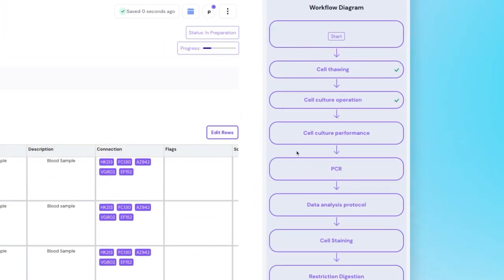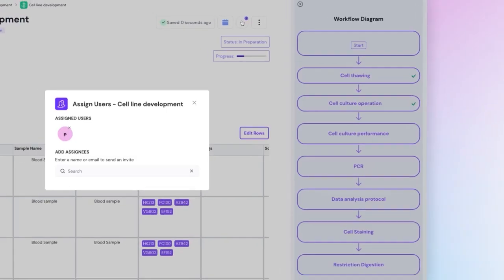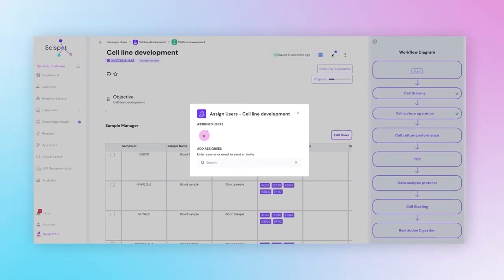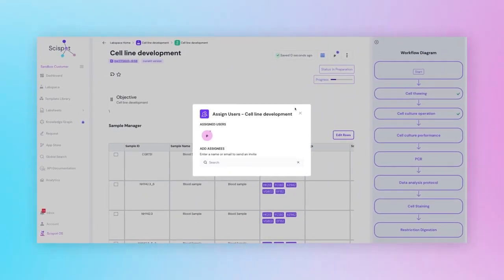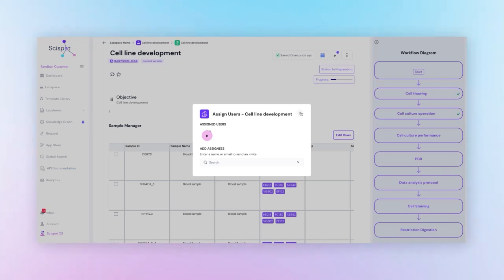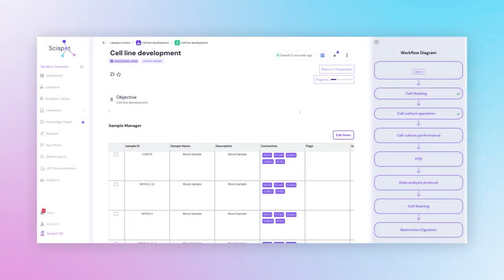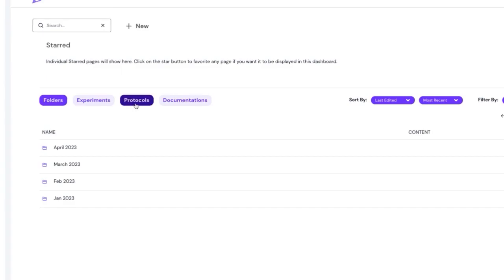Here, on the right-hand side, you can even assign tasks to your team members, add files, integrate your Google Drive or OneDrive, and collaborate in real time.